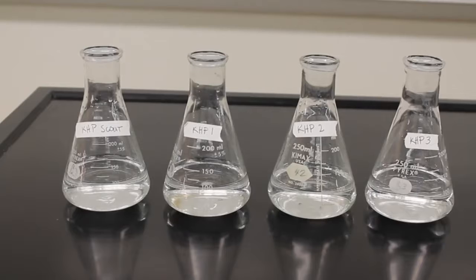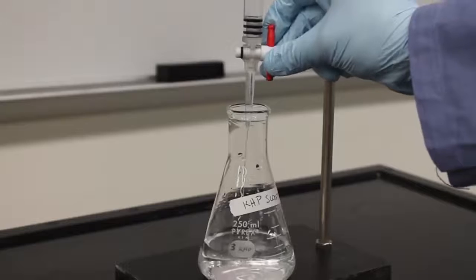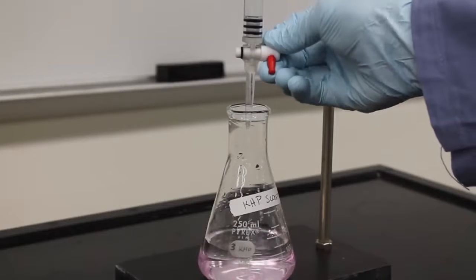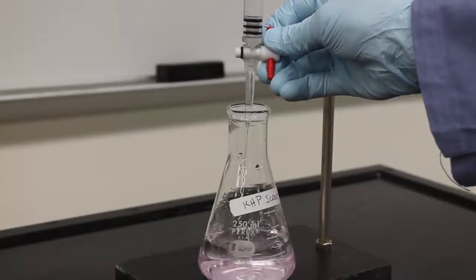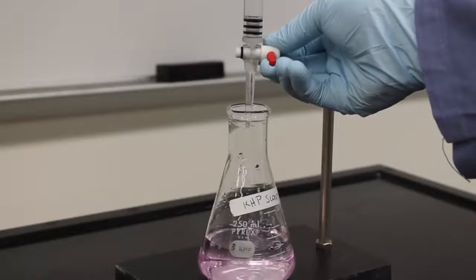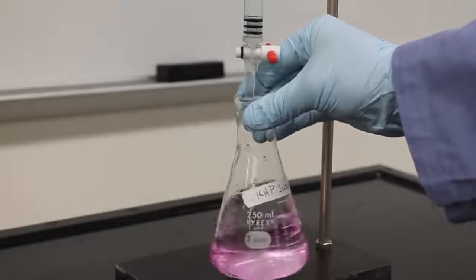A scout titration is completely optional. This titration is typically done pretty fast, and it does not need to be super precise. The point of a scout titration is to get a rough estimate of about how much titrant you are going to need to add to the rest of your solutions. A scout titration will only be valuable if the masses of KHP are close to each other. The masses don't need to be equal, but they should be within 25 milligrams of each other. Here my scout titration tells me that I need approximately 15.5 milliliters of NaOH for each of my solutions.